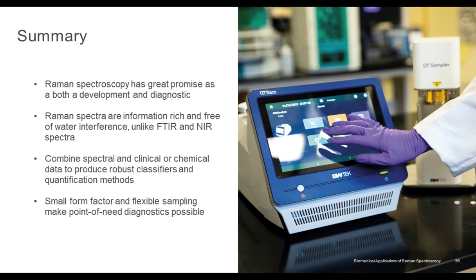You saw that with the very narrow bands in Kristen's slides. And it is free of water interference, unlike FTIR and near-infrared spectroscopy. You're not going to get the interfering signals from Raman, which lets you then go in and look at the molecules of interest, particularly. And it's relatively small amounts of sample prep for this.